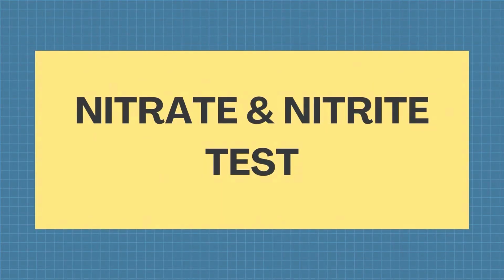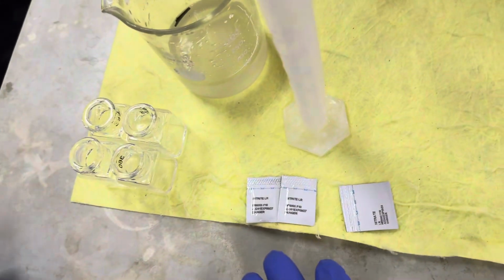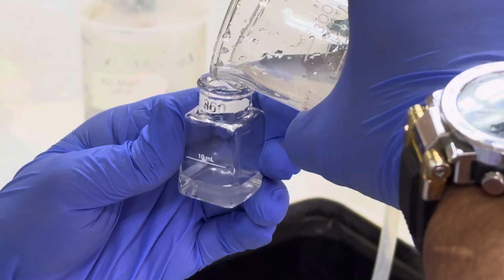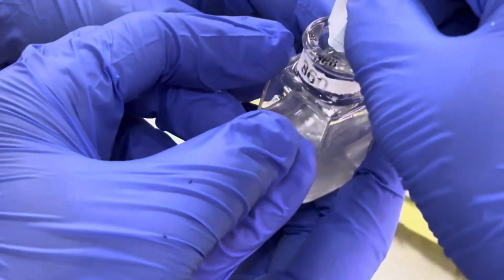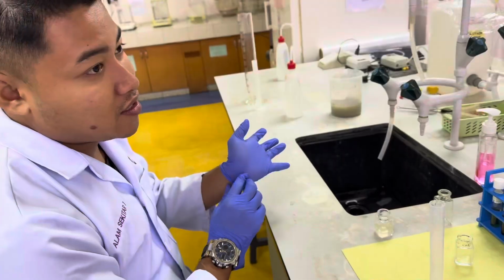Next is chemical test. The next test we are going to carry out is nitrite test. For nitrite test, first you have to fill a square sample cell with 10 ml of sample water. Next, after filling the square sample cell, you have to add the nitrite reagent powder and then you have to swirl to dissolve. A pink color will develop if nitrite is present. And then, after swirling, let it react for 20 minutes.